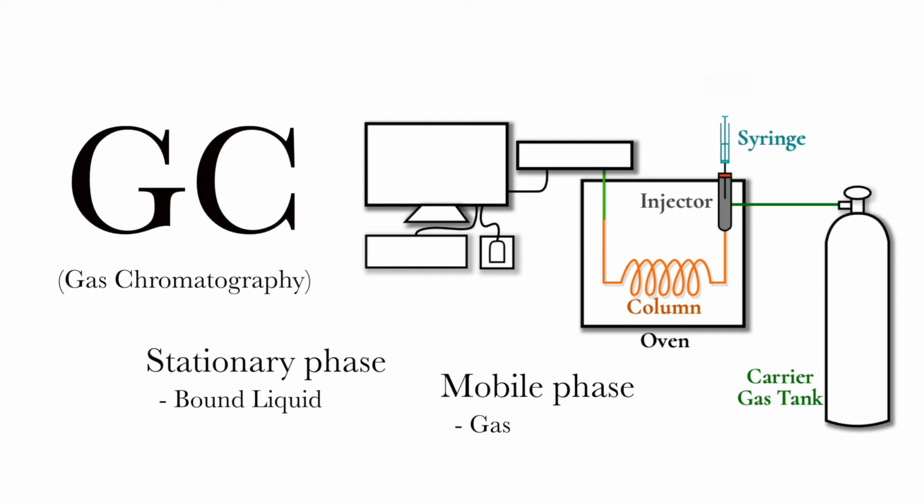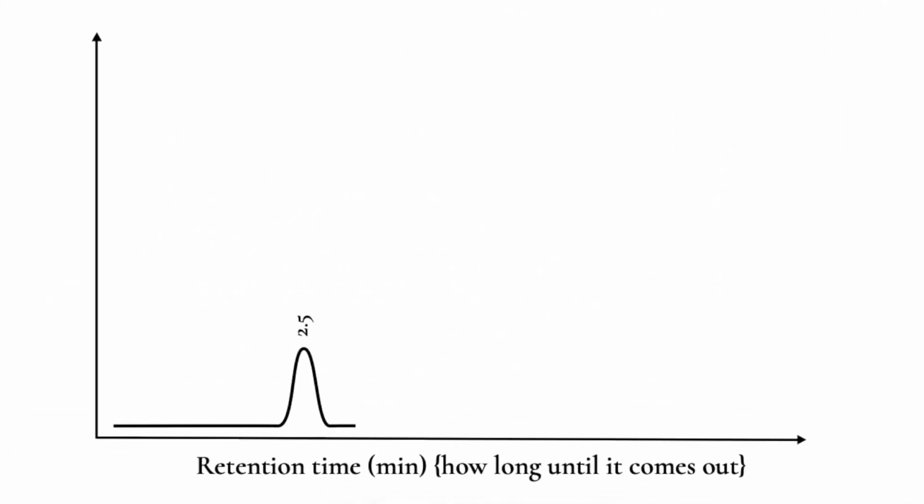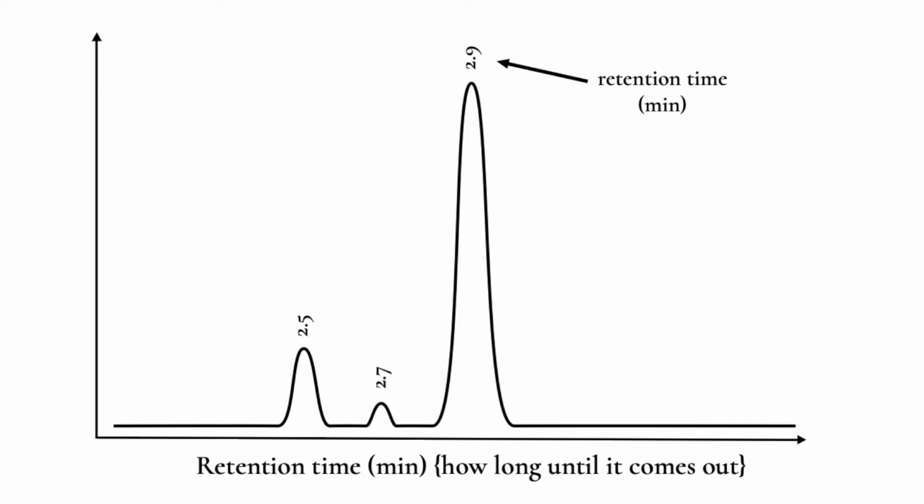Once it passes through the column, it goes to a detector, and the detector and a few other components turn this into a signal the computer can understand. You're expecting 3 peaks, 1 peak per product. You can determine which peak is which product using Zaitsev's rule or their boiling points. You can use the area under each curve to determine the percent you made of each product.